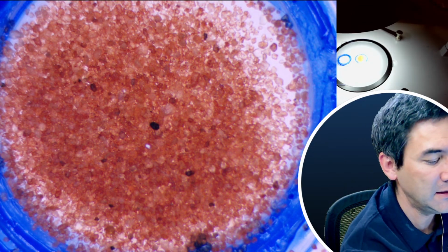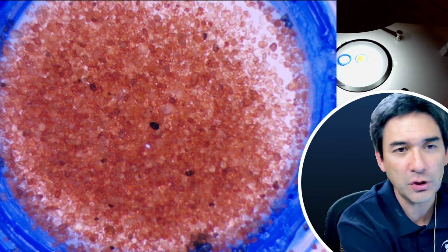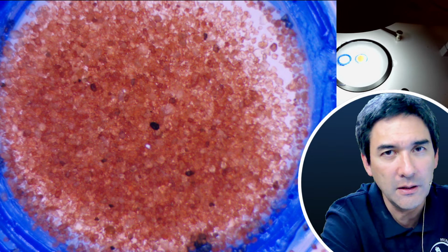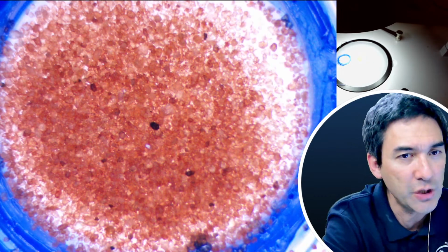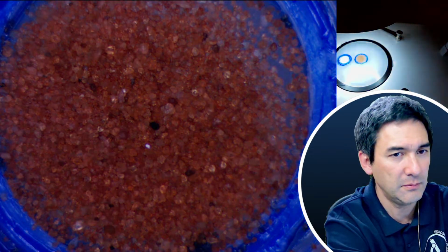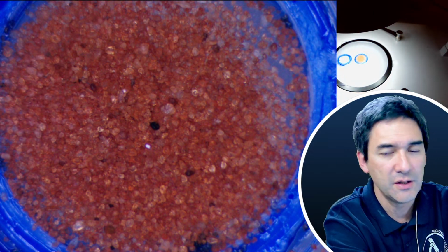And I think that indeed if you use a flashlight, a strong LED flashlight, and really go flat, then it might actually look even better, because then it will cast more shadows. But I think it might also depend a little bit on the extent that those sand grains are able to also allow light to go through.